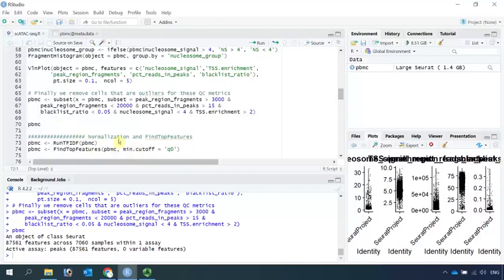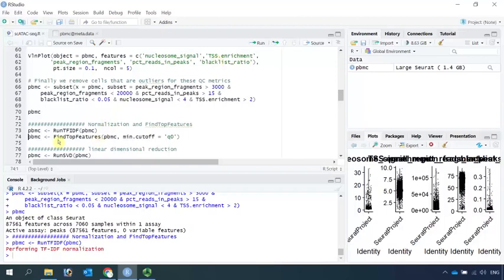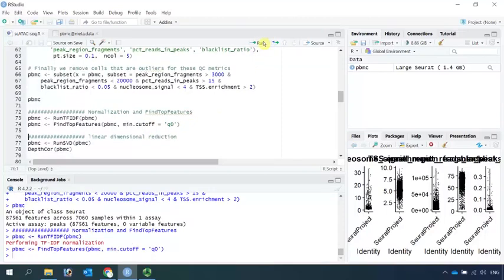Now, we can perform data normalization and find the top features. Signac performs term frequency inverse document frequency for data normalization. Then, we use the find top features to find the top features. Here, we use the minimum cutoff for the q0, so we kept all the top features for the rest analysis.